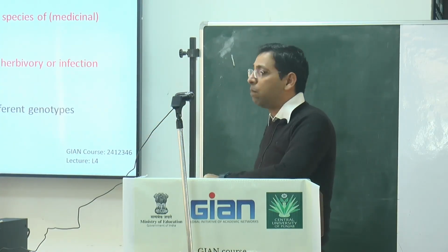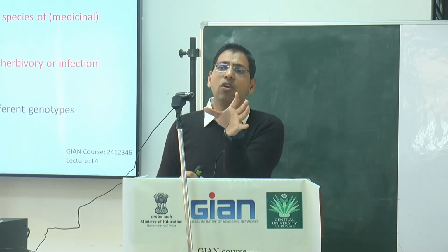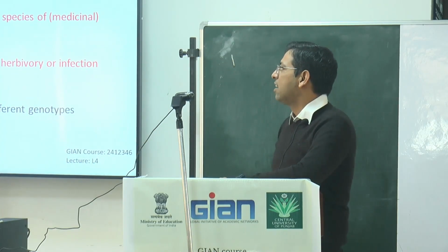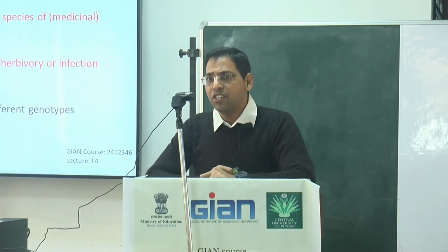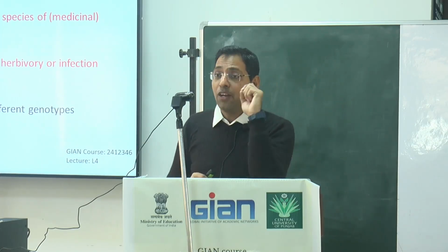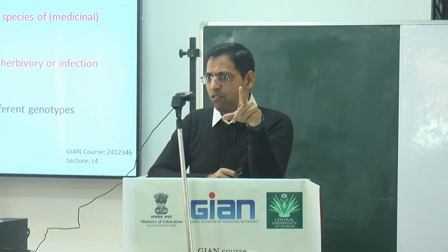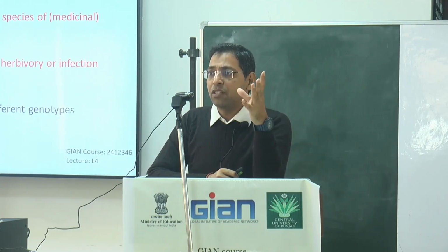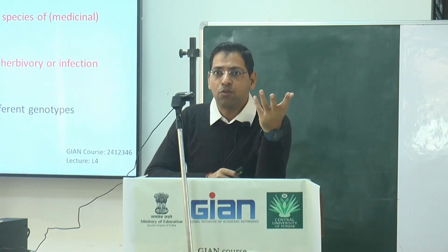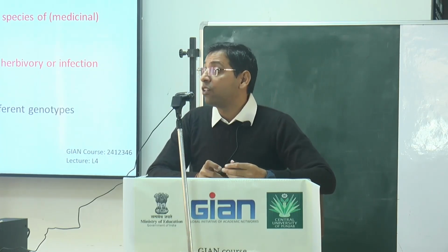Now I am coming to the application of plant metabolomics in NMR. I categorize the whole application of NMR into three different categories. The first one is the classification and characterization of different plants, in brackets medicinal. What is the meaning of it actually? We are different from each other. We have different facial features and different phenotypical features. But we also behave differently. Our way of talking, way of thinking, thought process is totally different from another person's. Even the same brother, offspring, also has a different thought process.